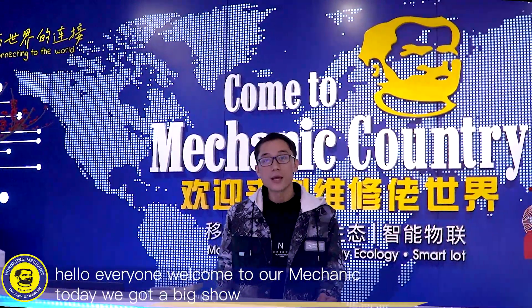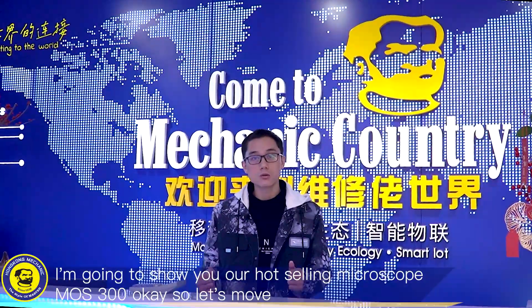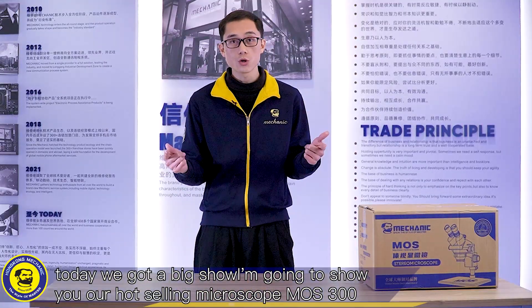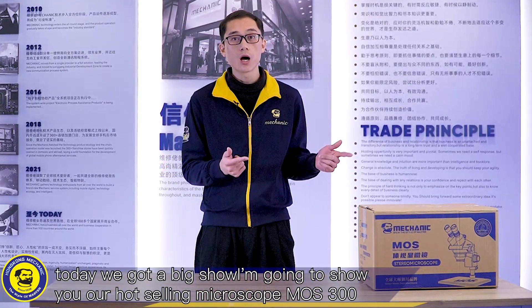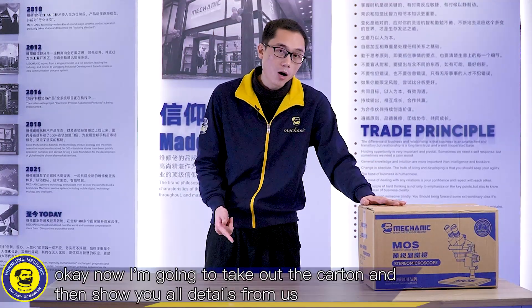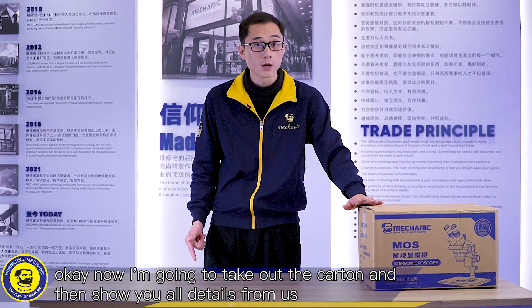Hello everyone, welcome to our mechanic. Today we got a big show. I'm going to show you our hot-serving microscope MOS 300. Now I'm going to take out the curtains and then show you all the details.